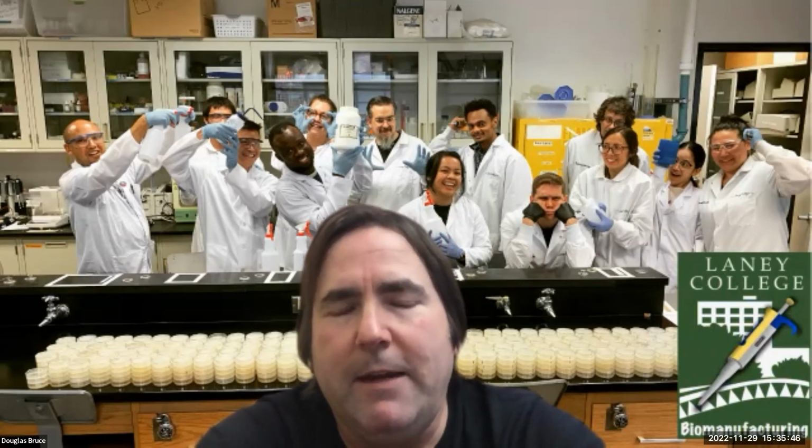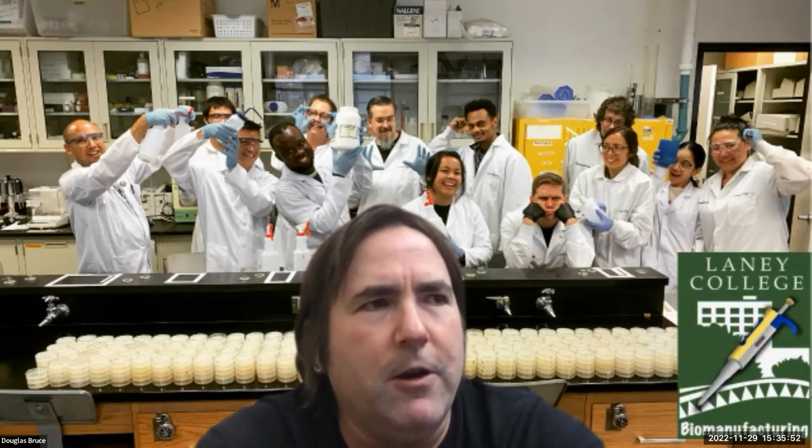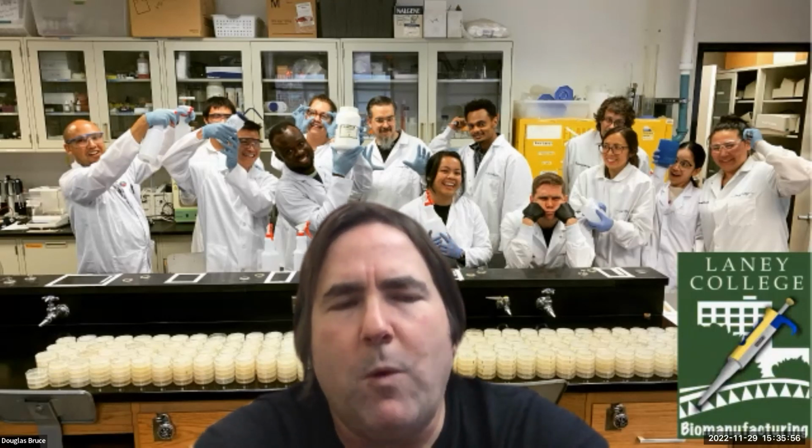Right. And I was leading to my next question, which was you brought up the issue of precipitation and that being a problem potentially when you're CIPing, but it could be a problem anytime, I suppose. What are some potential ways precipitation could occur? I know pH change could be one, but what else? And also, what are some ways to fix that? In other words, how can you bring a membrane back from the brink of death, I guess?